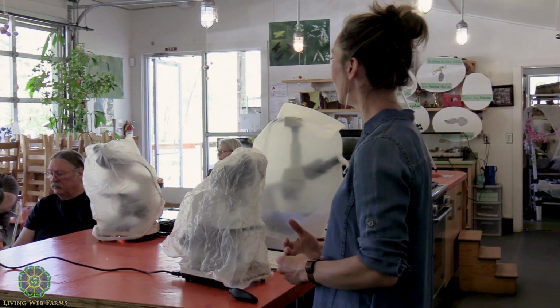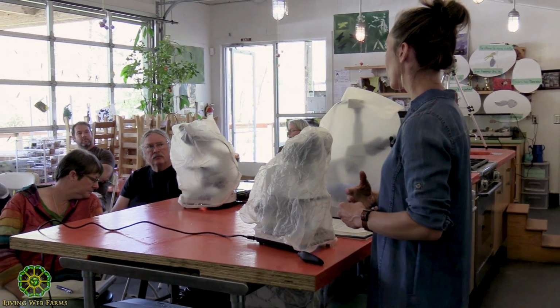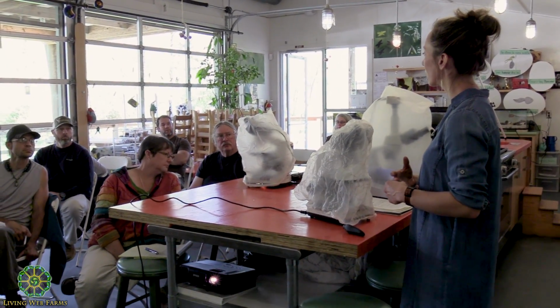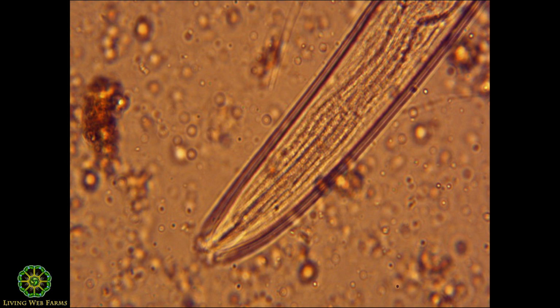Have you noticed different soil structures or types harbor different nematodes? Different soil types harbor different nematodes? Definitely. You mean like silt versus sand versus clay? Well, I haven't tested a lot of soils where I knew the order, I guess. But from what I know about what causes these organisms to flourish, soils with higher mineral content like clay soils are going to have more life in them than sandy soils, for example, that leach nutrients and leach water.